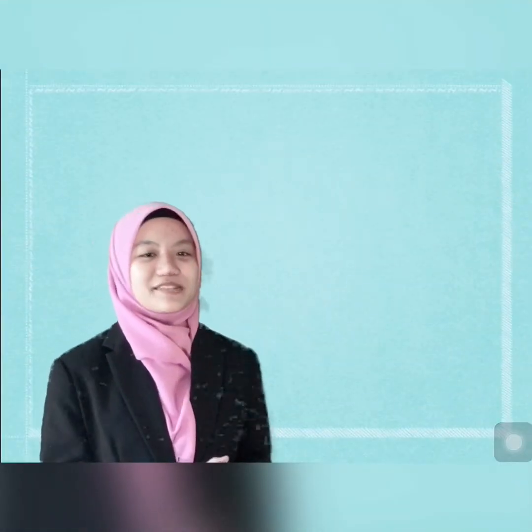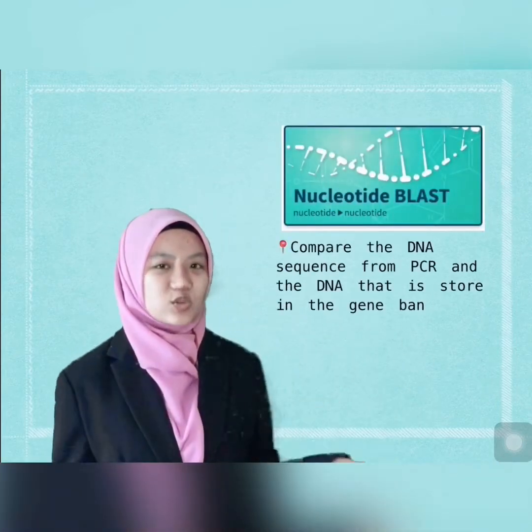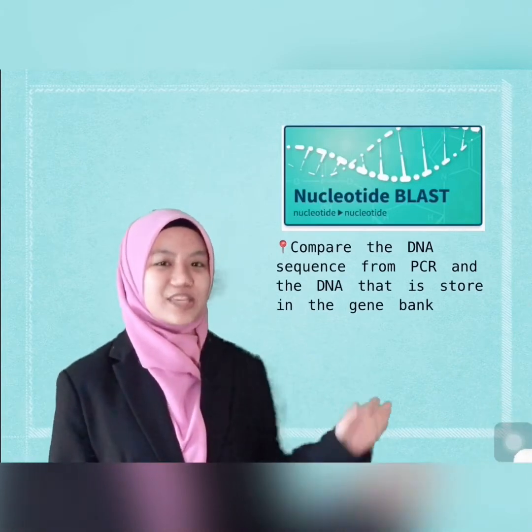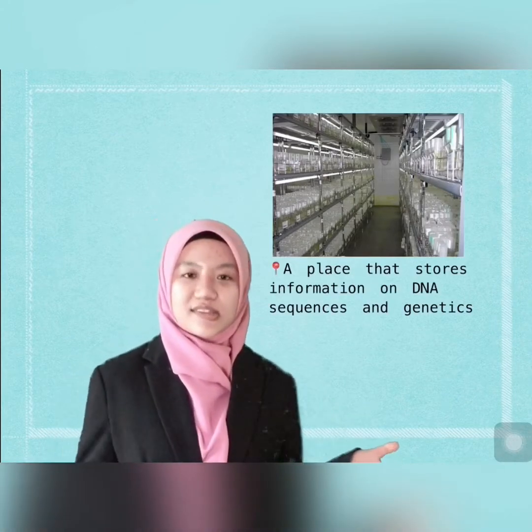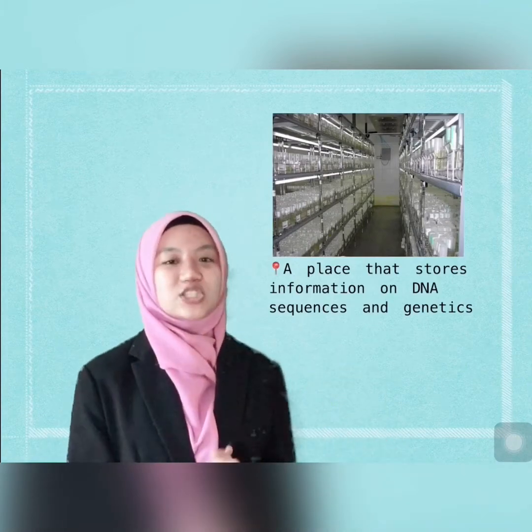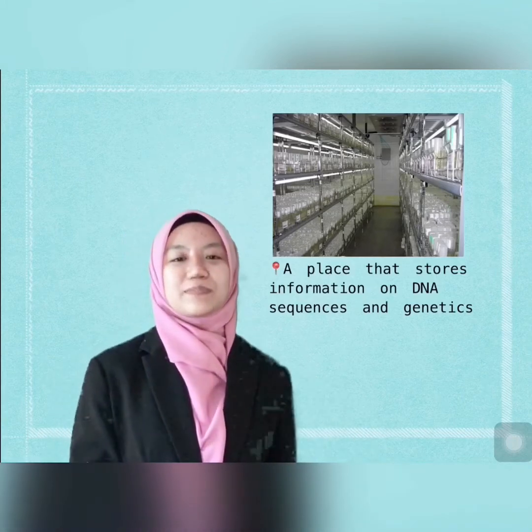So, for the results, we will use Nucleotide BLAST, or BLAST-N, to compare the DNA sequence that we got from the PCR with the DNA sequences in GenBank. And for your information, GenBank is a place which stores information on DNA sequences and genetics, not only for human beings but also ranging from bacteria to animals.